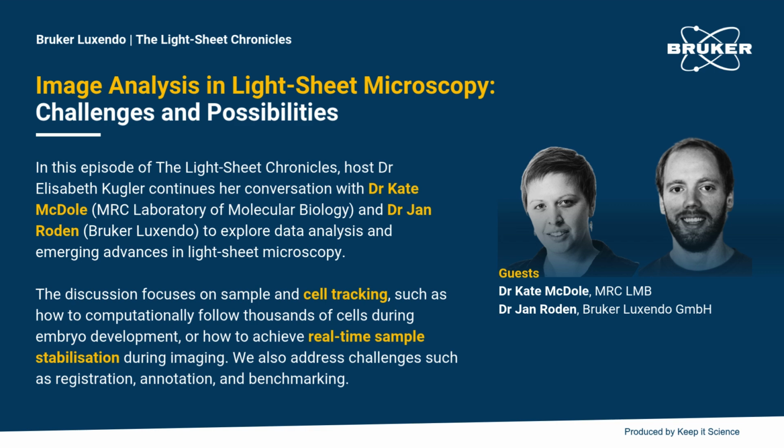Yes, because this is a big problem in light-sheet microscopy, particularly as more and more labs have access to these technologies, which on the one hand is absolutely fantastic. But the long-term storage, the processing, the handling, and the dissemination of data sets when they're on the order of dozens of terabytes, even after they've been processed, is still a huge challenge. A lot of labs still rely on sending hard drives back and forth. Over the pandemic, when everyone had time to do some data analysis, we sent 80 terabytes over Dropbox. This isn't sustainable as a model for every lab or for science to be most efficient going forward.